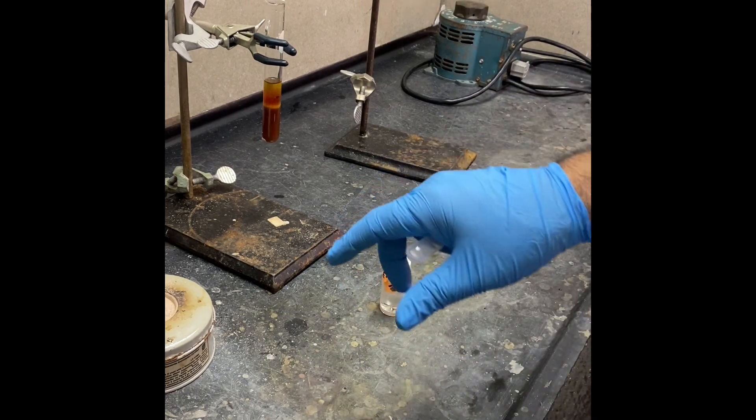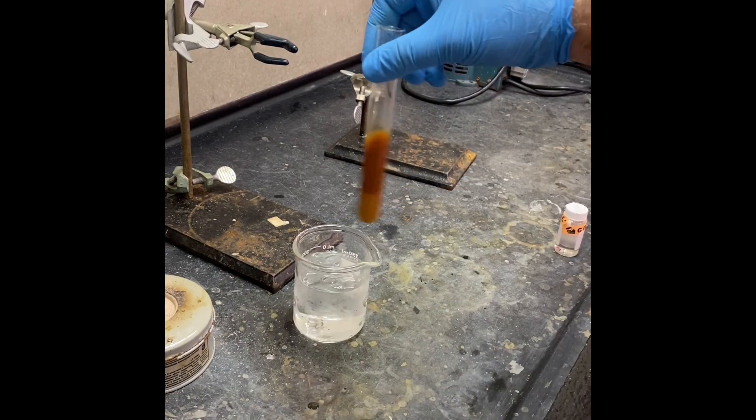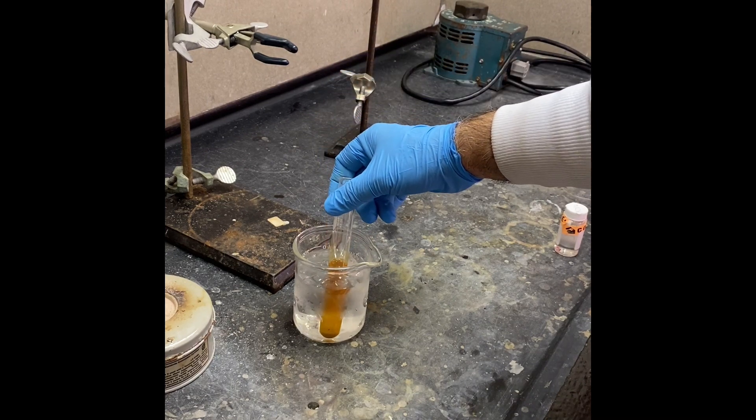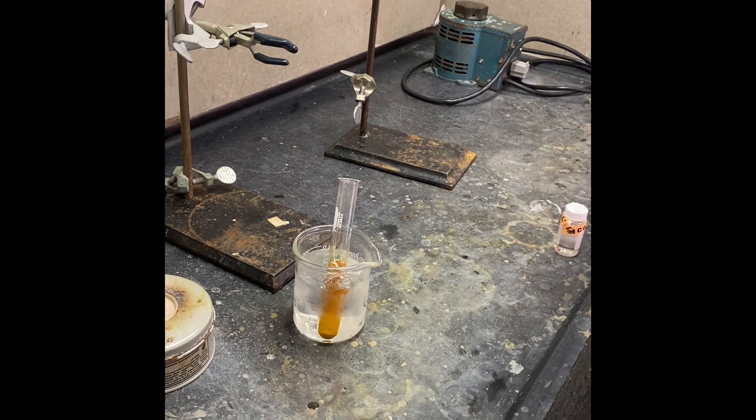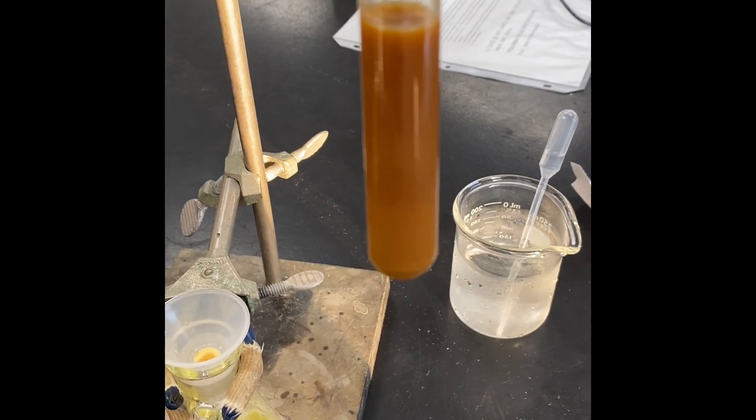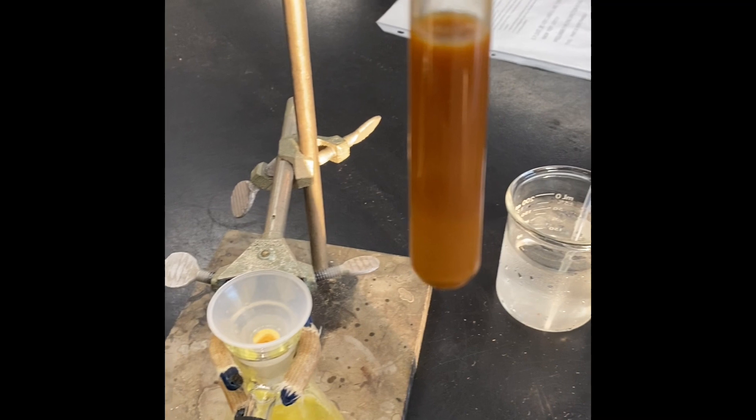We added acetic acid, and now we're going to cool it down in the ice bath. Let it cool down, and then we're going to filter it once it's reached room temperature or colder. After the water bath, that's the product, and now we're going to filter that.